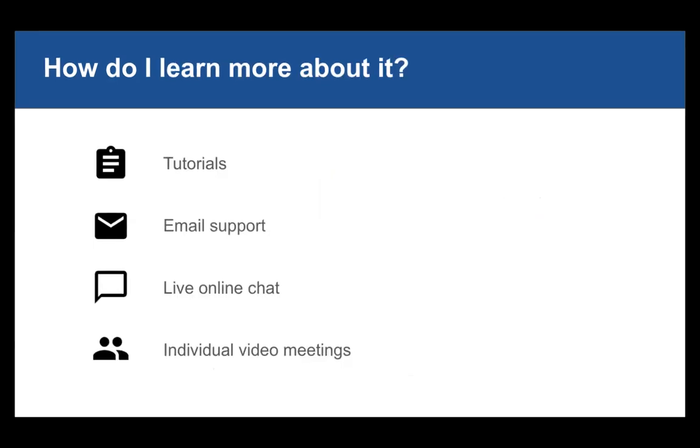So there are a number of resources that we've made available to try to make sure that the SFARI Viewer and associated tools from there are as easy to use as possible. And we really do want to try to engage the community and get suggestions or comments on the tool and features that they might like for specific use cases that they work with.